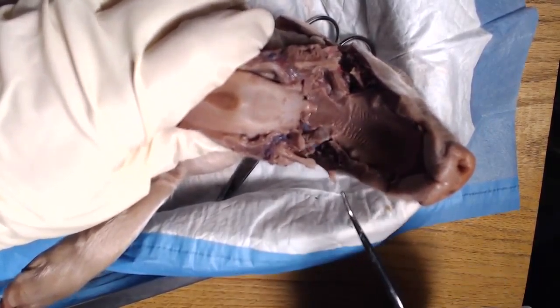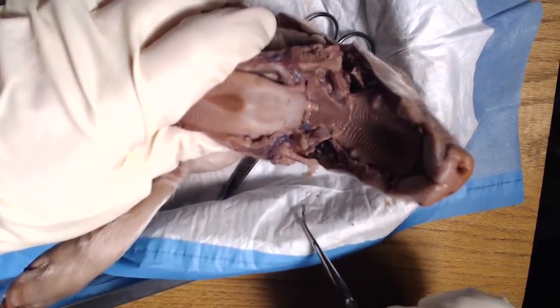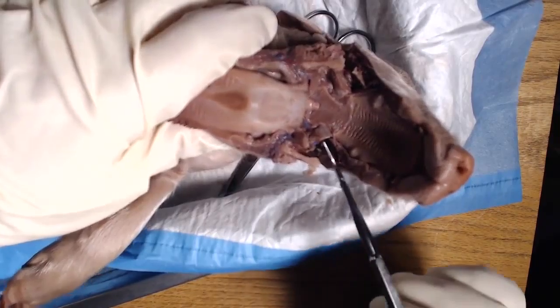Once again, if you are having trouble finding your epiglottis, you may just need to pull the jaw down further, and making deeper cuts on both sides will help you do that.